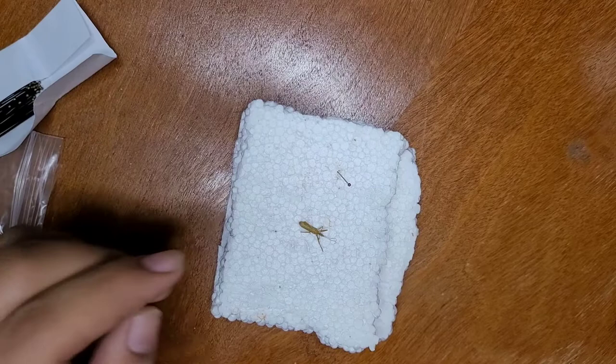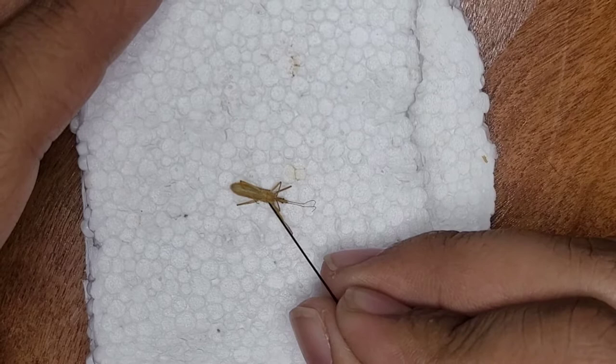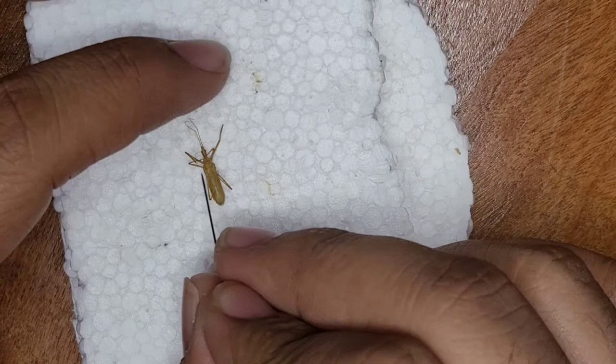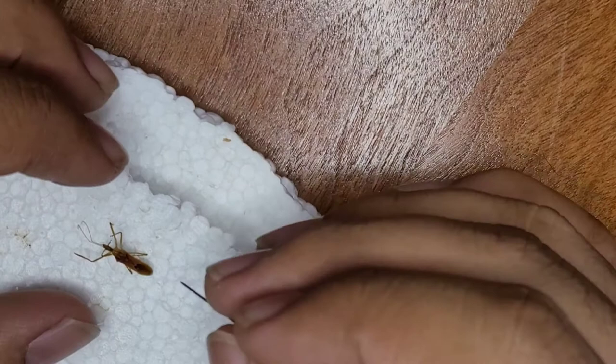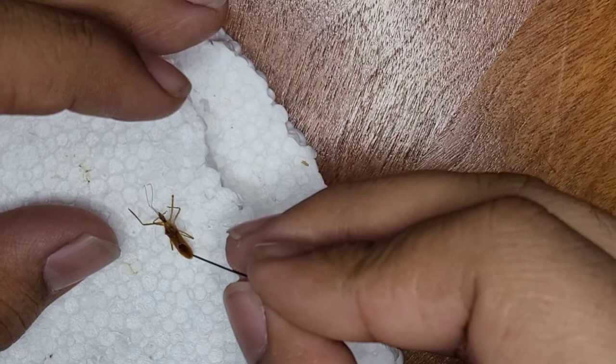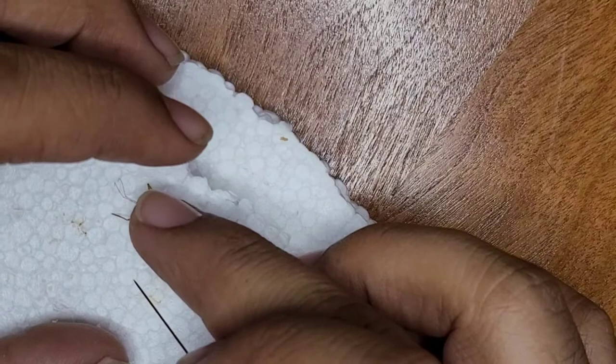We're going to be using this one right here. I'll go ahead and stab it into the styrofoam — this is honestly one of the easiest ways to pin insects. Watch as I attempt to flip it over so I can pin it, and now I'll try to get into a good position to mount it properly and ensure the legs are all in a somewhat okay position.